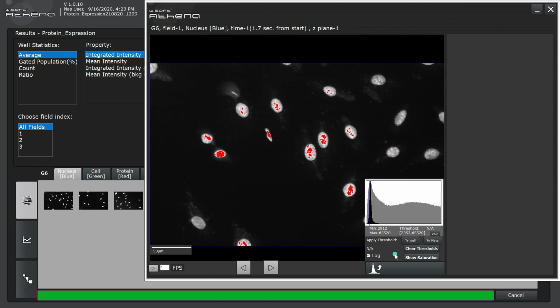If instead an image is to be used only for segmentation, such as often occurs for nuclei, then it is less critical but should be avoided to ensure good segmentation. We can use the pixel intensity histogram to interrogate raw pixel values within an image by mousing over the pixel of interest and following the location of the vertical blue line present within the plot. The value of the pixel is shown below the plot, here.